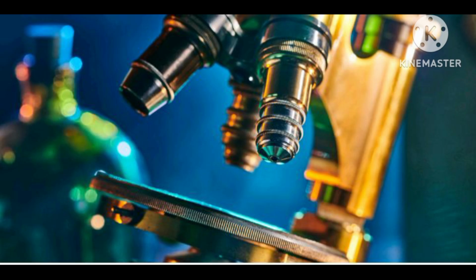There are commonly three types of microscopes. First one is optical or light microscope. Second one is electron microscope, and third one is scanning probe microscope.